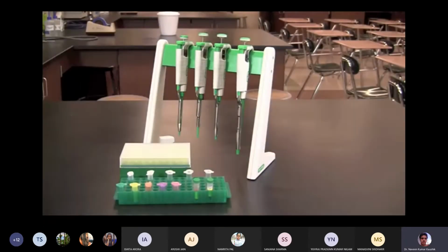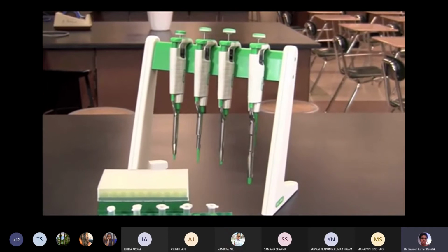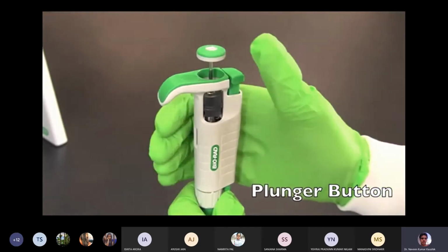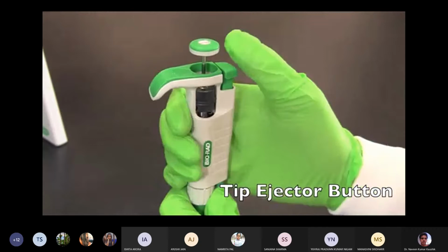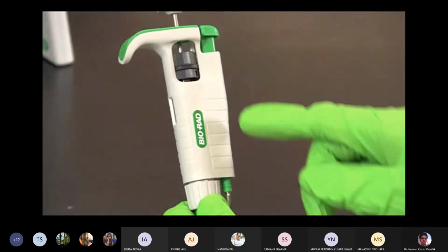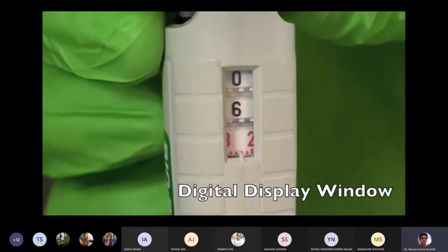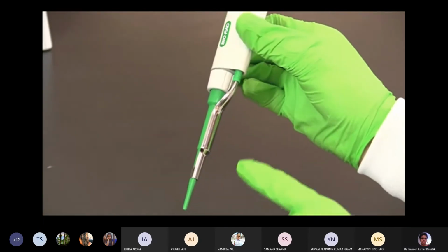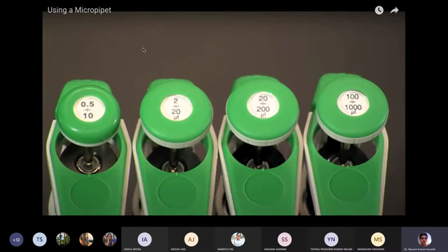In this video, you will learn how to use an adjustable micropipette. Micropipettes are one of the most commonly used tools in the molecular biology laboratory. An adjustable micropipette is used to measure and transfer small volumes of liquid. The parts of a micropipette include the plunger button used to fill and dispense samples, the tip ejector button used to remove used tips, the volume adjustment knob used to adjust the volume you wish to transfer, the digital display window that displays the volume being selected, the shaft, and the ejector arm, which ejects used tips, and a disposable pipette tip. The volume range for a micropipette can be found at the top of the plunger.